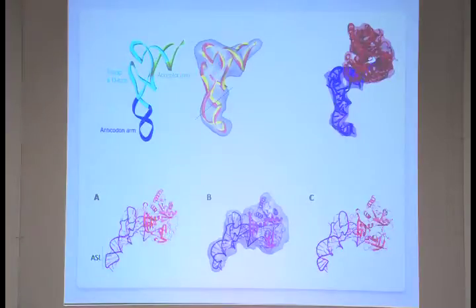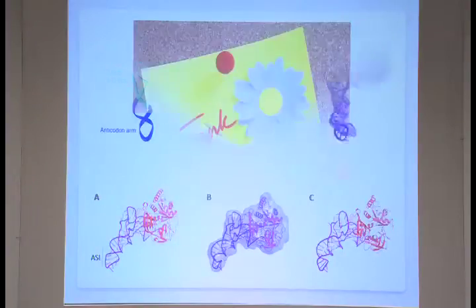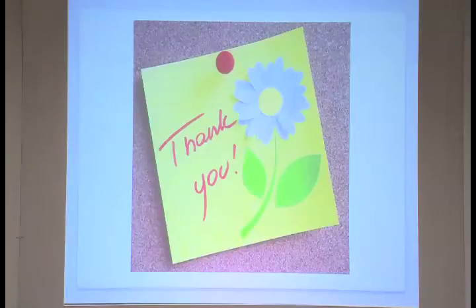And as I told, there are nicer methods, almost like crystallography refinement, which we saw in the morning. You have done the tutorial on that. So these are the major methods. Different labs have developed other methods also, but more or less these are the methods used these days.